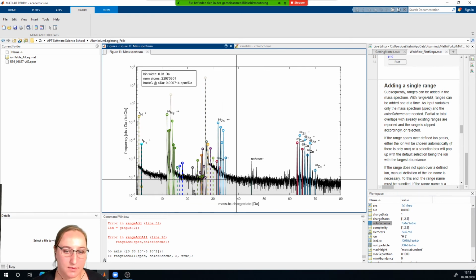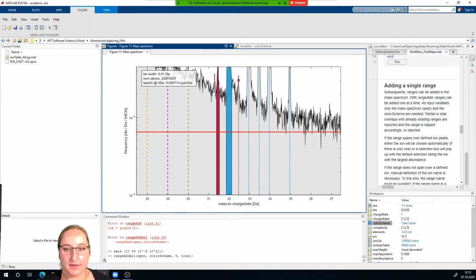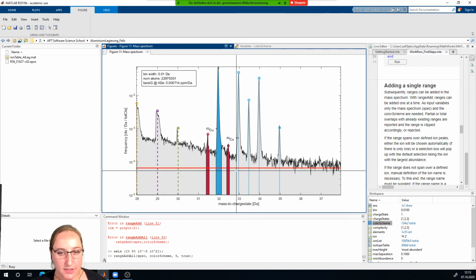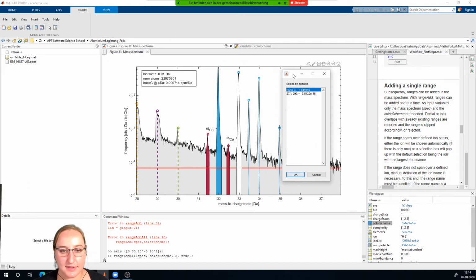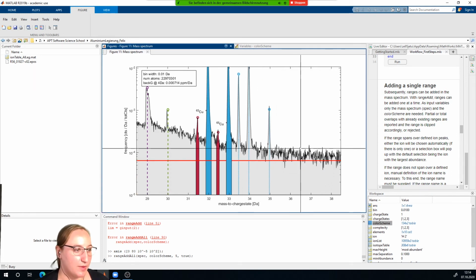So basically the red line will be made between the 2 points. That's why you need the 2 points, and afterwards hit OK. So yeah, and then you can continue. Do you have any questions about this app? Please try it out, and if it works or if it doesn't work, that would be helpful.